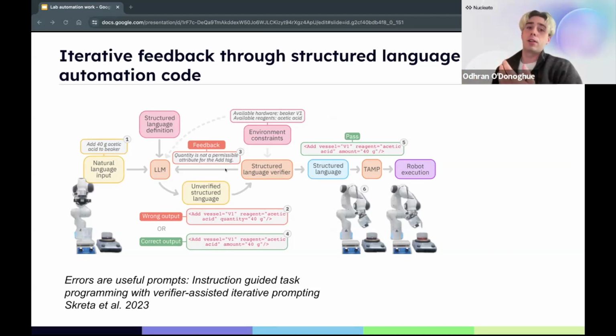It may make an error. A system can say, hey, this doesn't look like the right scripting language. Let's fix this. And this iterative feedback can allow for a pretty accurate generation of long-term tasks in writing protocols and running experiments. And in this case, the Matter Lab is getting this running on robots.